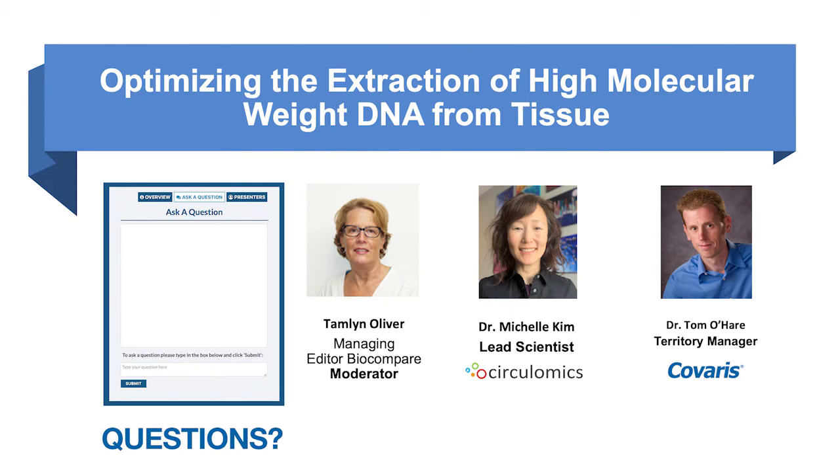So the cryoPREP works by putting your sample in a small bag and then putting the entire bag into liquid nitrogen to freeze your sample. And that makes the sample more fragile, more easily broken when you put it in the cryoPREP itself.